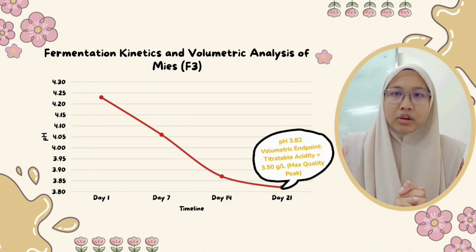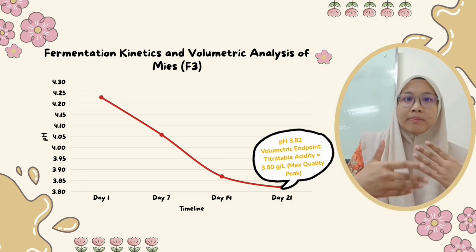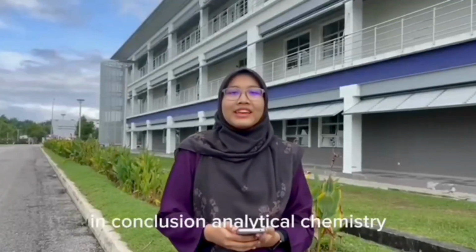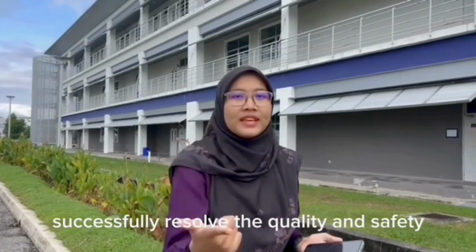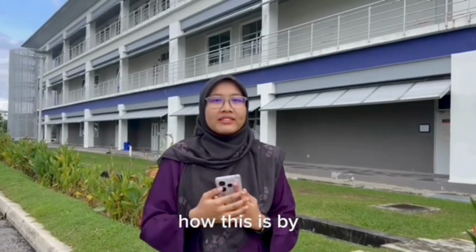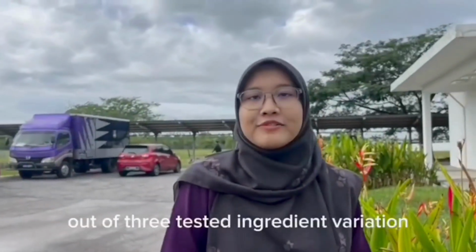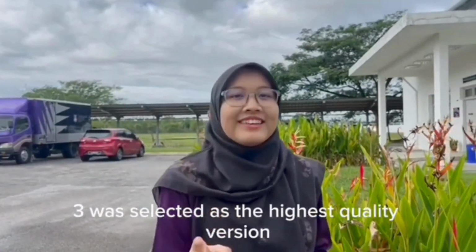The high concentration of organic acid in formulation 3 acts as a natural preservative, protecting the beverage from spoilage pathogens while preventing a flat, unappealing taste. In conclusion, analytical chemistry successfully resolved the quality and safety inconsistency of traditional fermentation. How? By achieving a scientific blueprint for standardized mass production. Out of 3 tested ingredient variations, formulation 3 was selected as the highest quality version.